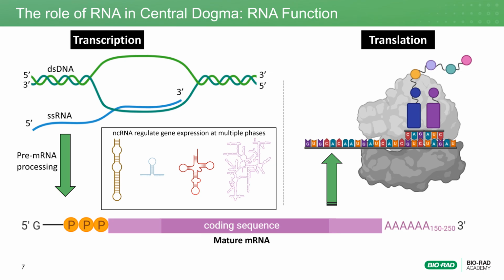When learning how RT-qPCR is utilized to study gene expression, reviewing these fundamental principles will prove substantial when we begin exploring considerations for sample preparation and the initial RT-qPCR protocol. Let's review some of the characteristics of RNA before continuing in on these topics surrounding RNA isolation.